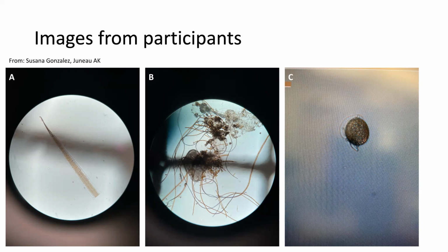Because right here I can see that there were different magnifications used. Yeah. And it would be helpful, at least getting a size too. Yeah, no, that's a great point.